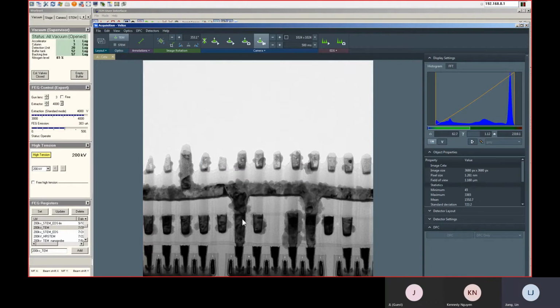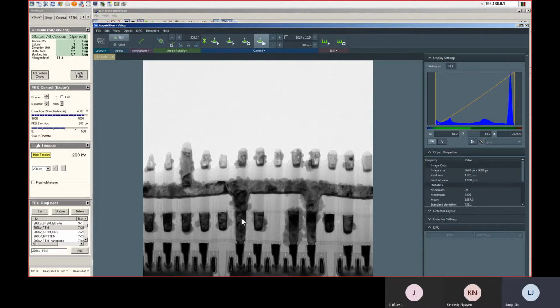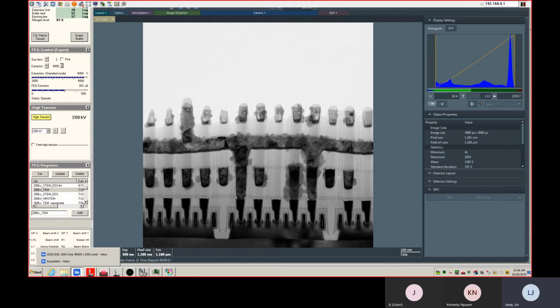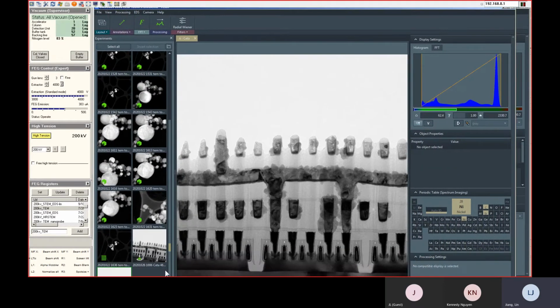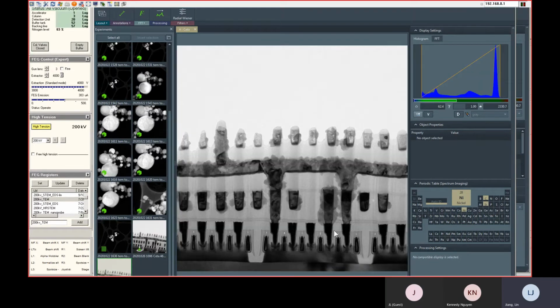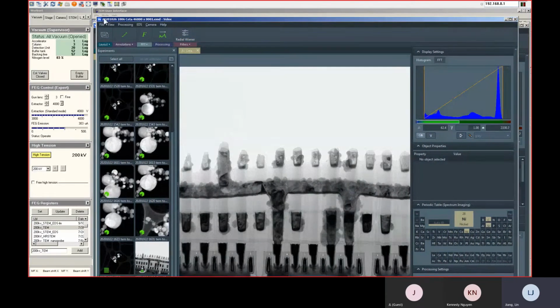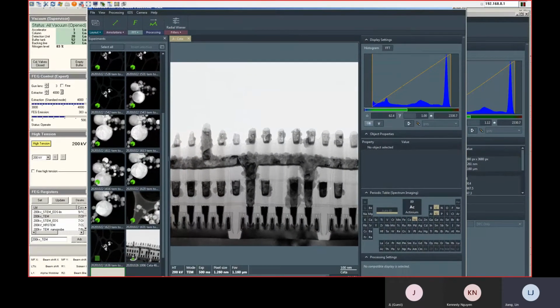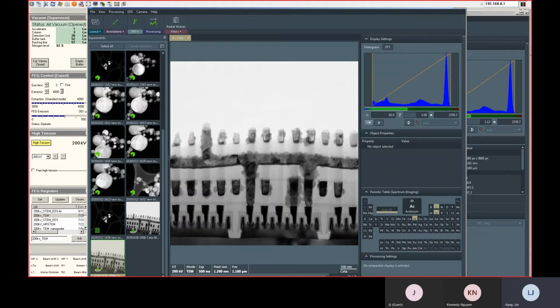If you move, you can record the video, right? And you stop view. And your data is gonna be in your processing window here. If you open another window, this is your processing window. This is your image tab, this is your video tab. If you make it smaller, go up, this is the sidebar, you got 21 frames. This is your frame recording.